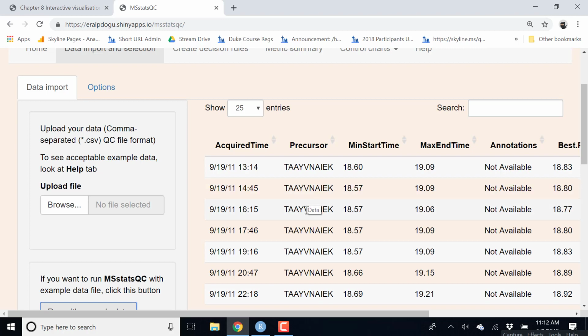The system may fail to perform well continuously for many reasons, like technological conditions such as different laboratories, the person who's doing the experiment, or temperature of the room. So as the experiment goes on, it may go off the limits that we expect, and it's important to detect that. This is the reason that we developed this software, to detect those deviations from the expectations that we have for our experiments.